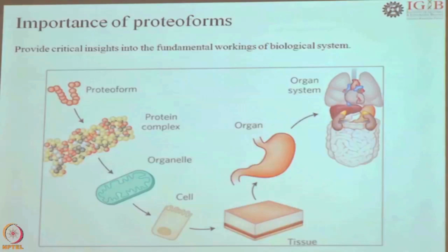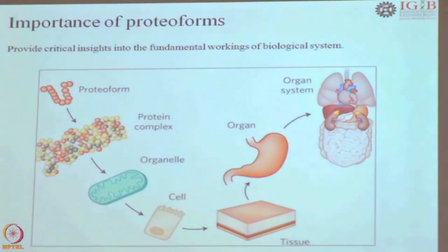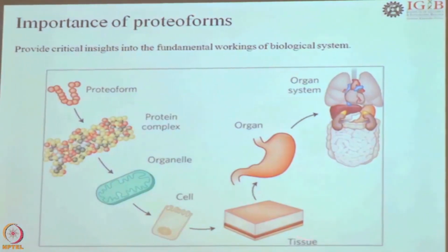Rudy very nicely covered this area in Nature Chemical Biology this year, 2018, on how proteoforms will be implicated in the future of biology. So, we first need to understand where these proteoforms are, where they are expressed, and what the possible roles of these proteoforms are. A tissue-wise atlas of proteoforms needs to be made, and that is the research topic on which my student Anurag, who is in the audience, works, and some of the work that I will be presenting is done by him.